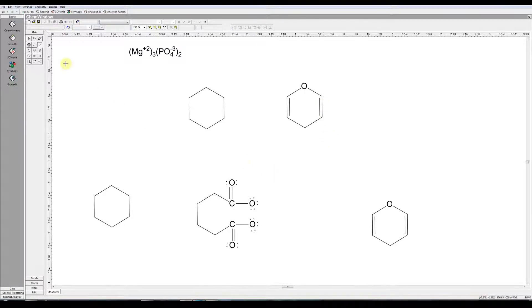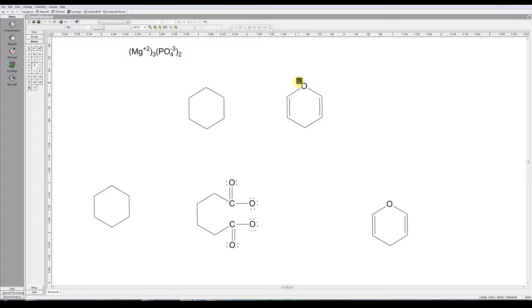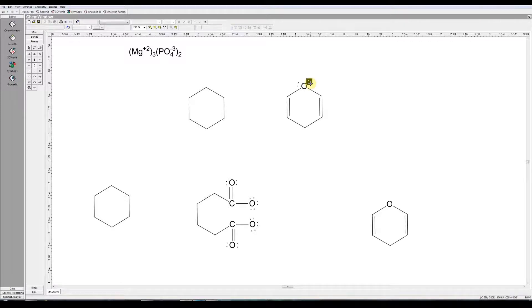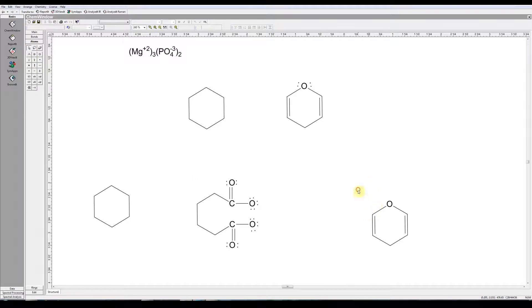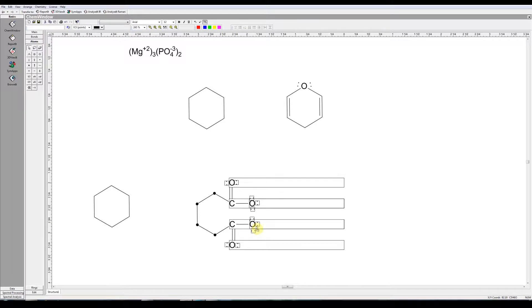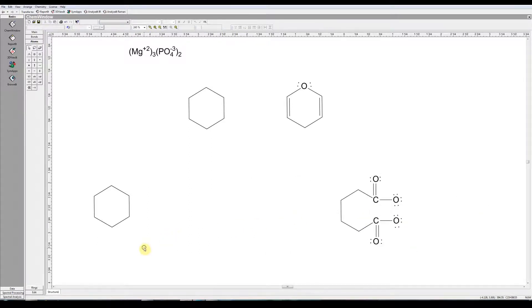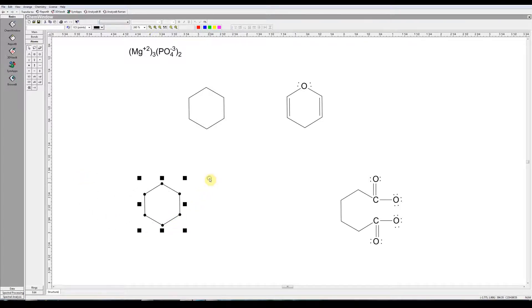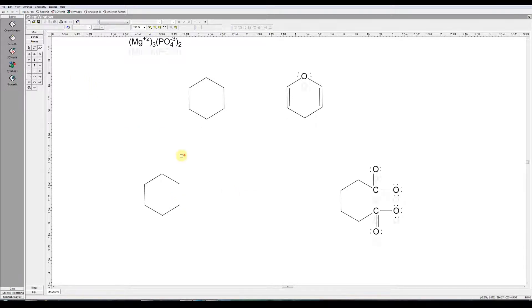We should put some electrons on that. So that's under the atoms group. Non-bonded electrons. I'm holding the shift key down so I can control the distance and the angle at which these non-bonded pairs of electrons are sitting. But even here it's still a bit difficult to get a hold of them. Now this carboxylate group. We're going to take a ring and break the ring and add this to it. So we want to choose the eraser tool. Hold it until you see the bond, the hitbox of the bond you want to remove. Then click the delete key and only that should be deleted.